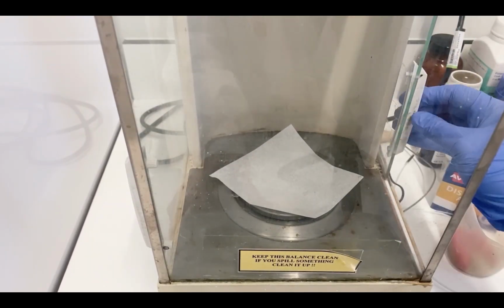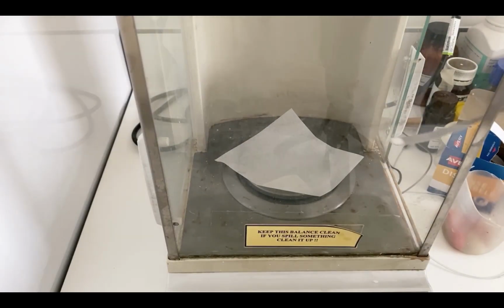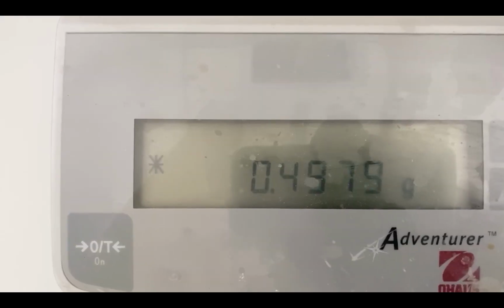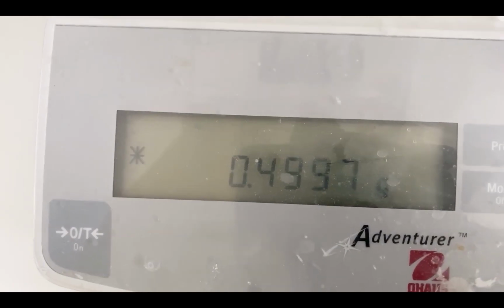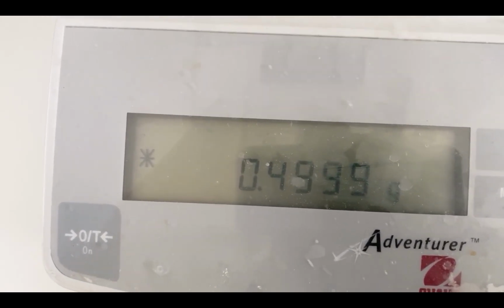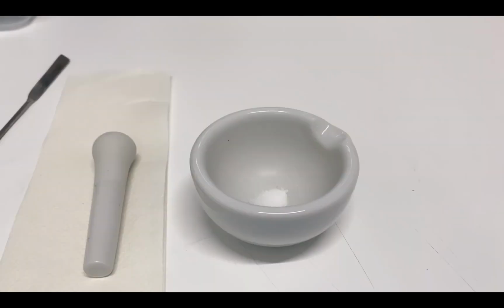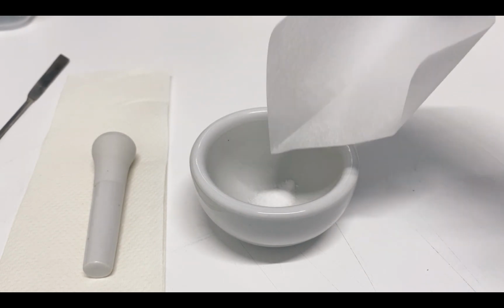Measure the remaining amount of magnesium sulfate needed to prepare 75% magnesium sulfate, in this case 0.5 grams, and perform the same steps in weighing. Add 0.25 grams of magnesium sulfate, that is equal amount to the glucose initially measured.